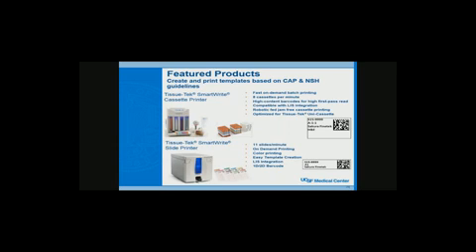If they're using a barcode, in other words, a linear barcode, the one you see with the up and down lines, that could be true. If you're using a 2D code, then it will hold plenty of information. And that's why you'll see most of these systems are going to 2D. They call it 2D data matrix or other. Here on the screen, you can see the 2D code. And so that might be, I'm not sure what etcher it is.